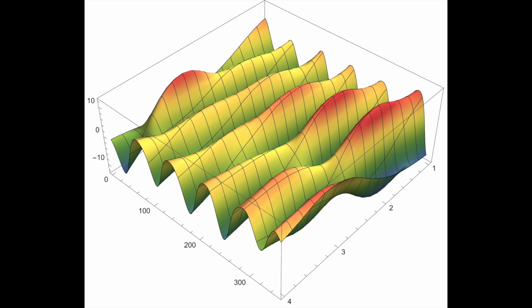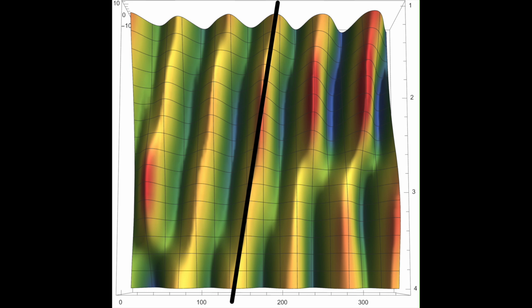Note that grid lines of constant time cross the wave's surface at a considerable angle. To emphasize the progressive nature of the contraction, it helps to suppress some of the data by rotating the data surface until it is flat. It is now essentially a color-coded contour map. The middle contraction is the most regular, and I have drawn a straight line along the crest to emphasize the smooth progression of the contraction along the ampulla.